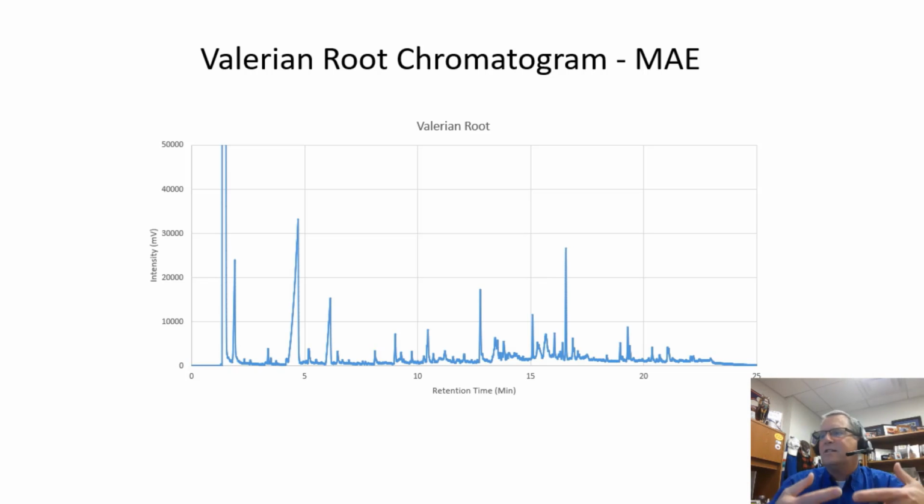But you can see the kinds of things that we can do with microwave-assisted extraction married up to something like a Mini GC, when we're thinking about greening our instrument profile and saving some lab bench space: the microwave-assisted extraction and the Mini GC. This was a simple extraction. I think she went straight into water and then diluted the thing with methanol.